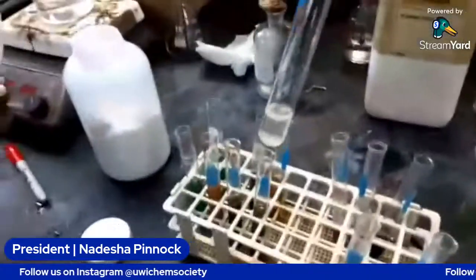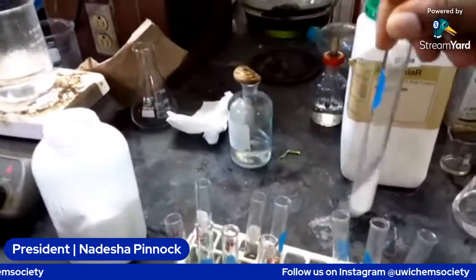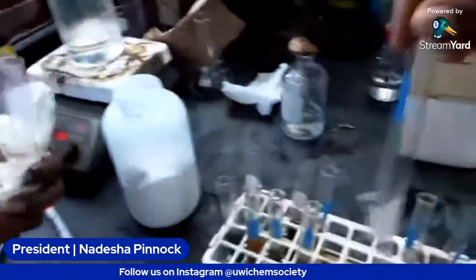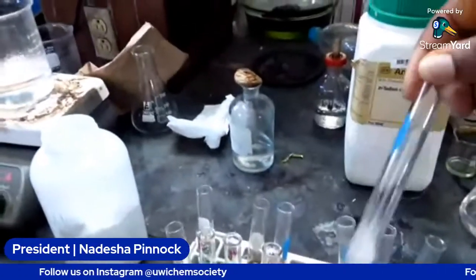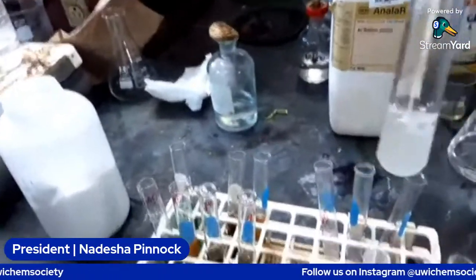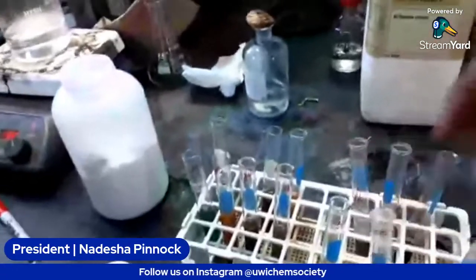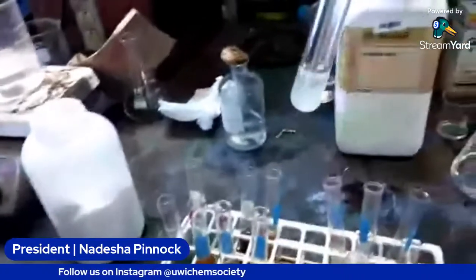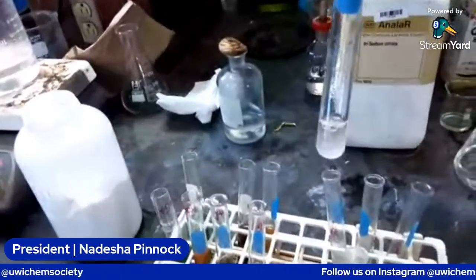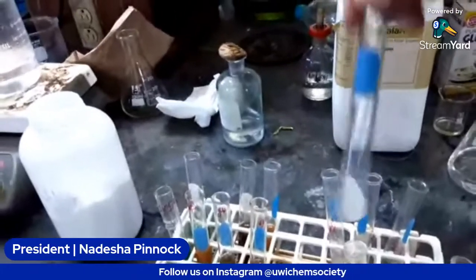This one stopped. This is the sugar. It's not fizzing, but I have a feeling it still has to be. But we shall see. See the volume go down?